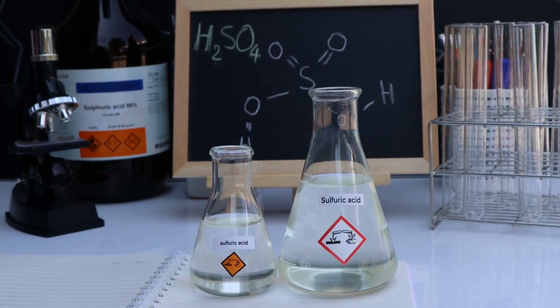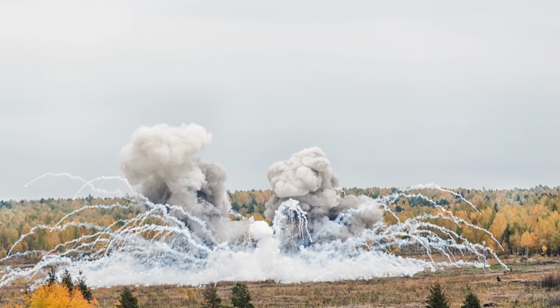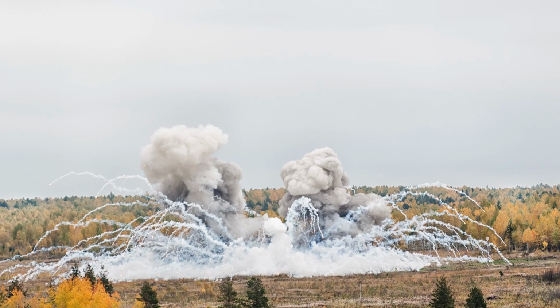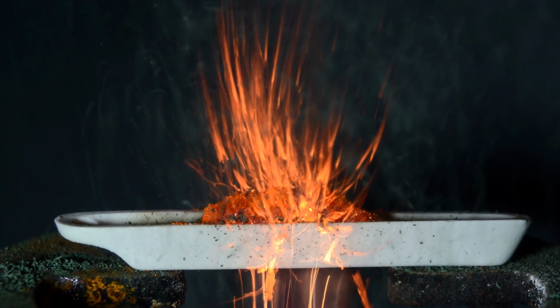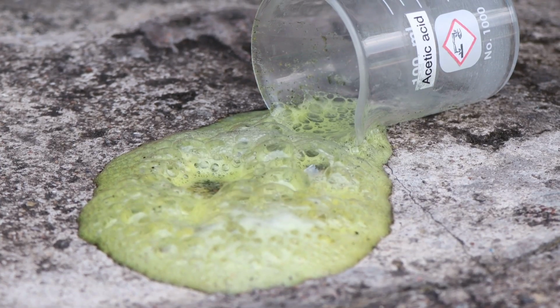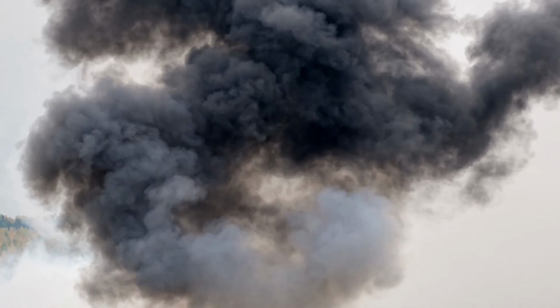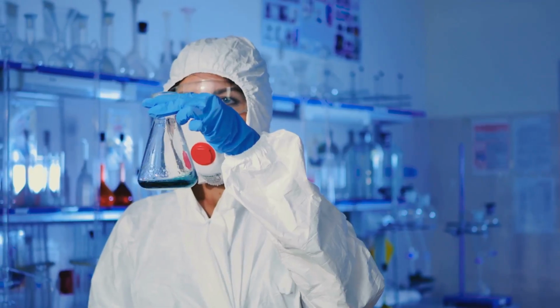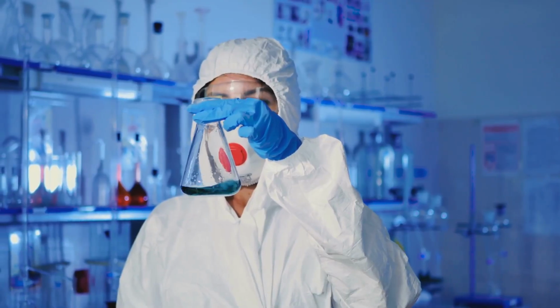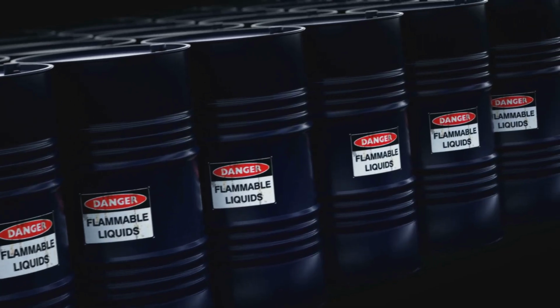The third primary hazard is reactivity. This one is a little different. Some solvents can have violent chemical reactions when they're mixed with other substances. For example, some organic solvents can react explosively with what we call oxidizers, like bleach or certain acids. This isn't just a simple fizz or bubble. We're talking about a reaction that can release a huge amount of energy very quickly. It can cause an explosion, release toxic gases, or start a fire. This is why you must never play amateur chemist and mix chemicals unless you know exactly what you are doing. Always read the safety labels to see what a solvent should not be mixed with.